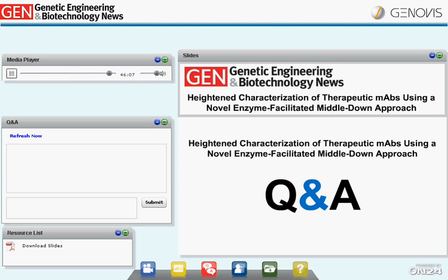Okay, so we have a listener who apologizes first in case they missed this if you already said it, but they wanted to know, what is the stationary phase of CaptureSelect? It's agarose, and the resin is from the Netherlands. It's a llama antibody fragment that has been raised against the conserved region in the Fc of IgGs, which is immobilized onto agarose.